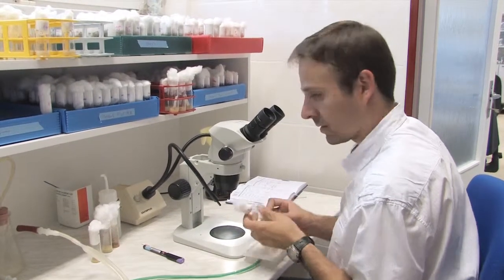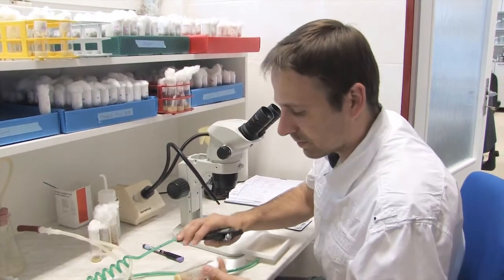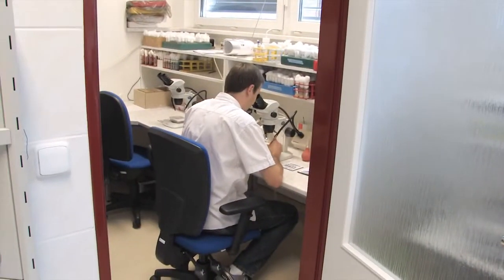Basically, we are combining different approaches using molecular biology, classical genetics, developmental biology. We're using molecular biology to clone the genes, to modify them, to introduce mutations into them. Then we usually transfer these modified genes into flies.